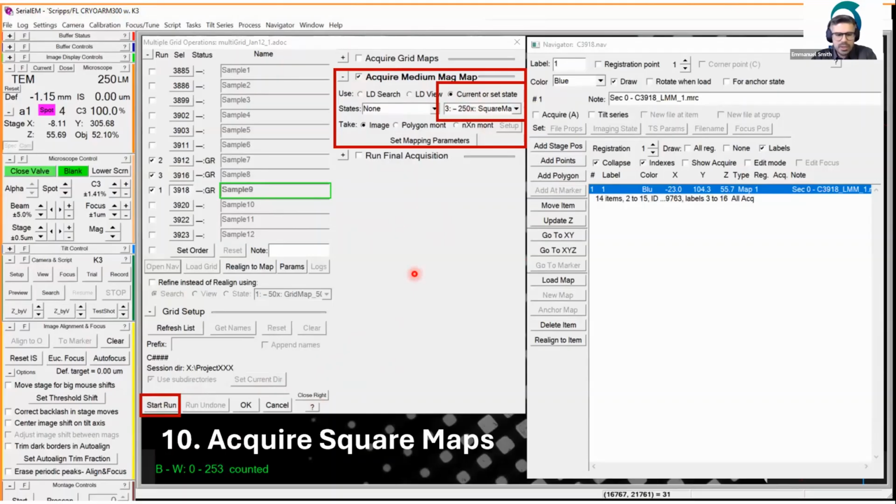Now, there are routines in SerialEM to realign grids when there's been some atlases and you get a grid reinserted on a later date. But for all the LoMag stuff, as I mentioned before, the offset between grid reinsertions is quite minimal. So we have disabled those and really we've streamlined this way the navigation between different samples and collecting single square images and really kind of screening and setting up all the preliminary data points that we need for long unattended data collection. All right.